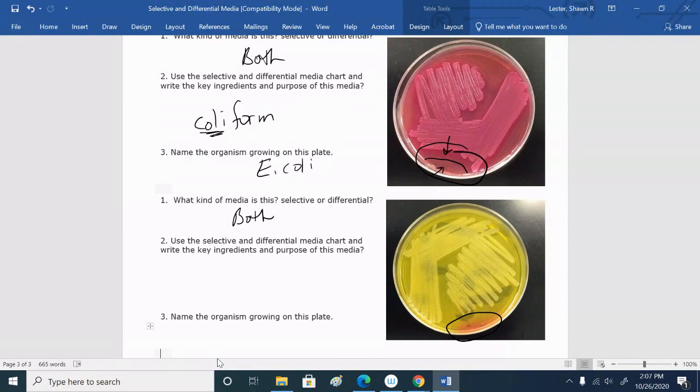And we actually do this experiment in lab, or at least we used to, where you guys would take a swab and swab your skin and make a skin culture. And we would find that some students, and it's usually about a third, have Staph aureus on their skin, which is how you typically find it in the general population. About a third of people have Staph aureus, and most everyone else has epidermidis, and a few have some other things.